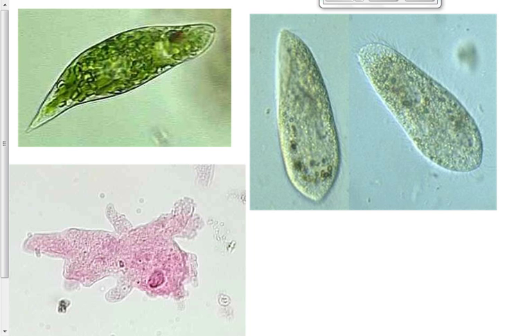The other way to let more or less light in, because we didn't get to it yesterday, is on the bottom, underneath the slide here, you'll see this little tab. Everyone see what I'm pointing at? Opening and closing that opens and closes an iris that is underneath the stage, and that controls how much of the light from the light source gets through. If it's closed most of the way, not much light gets through.